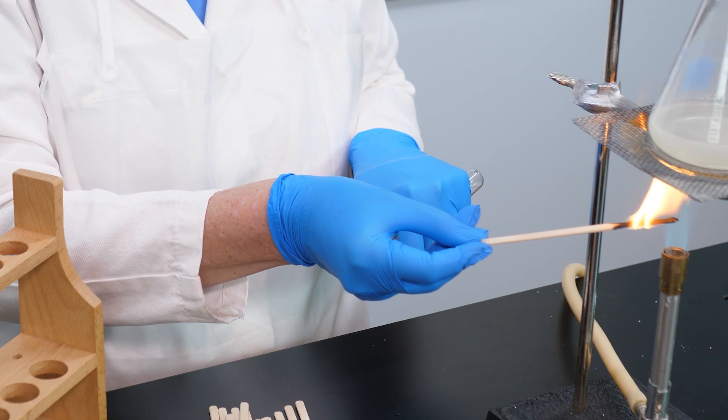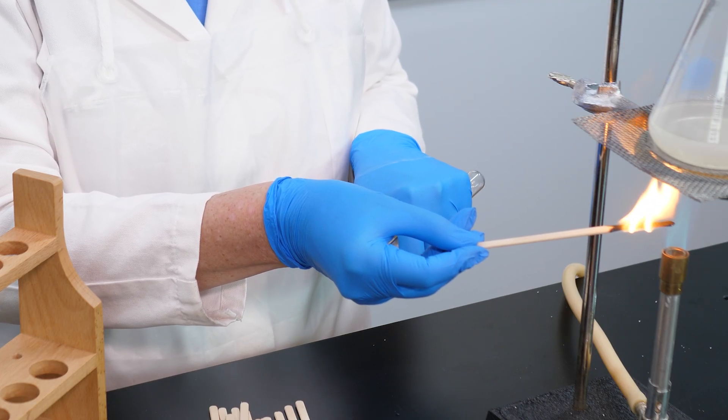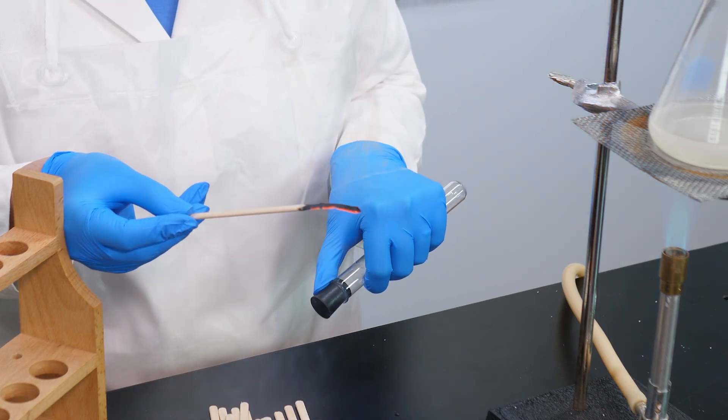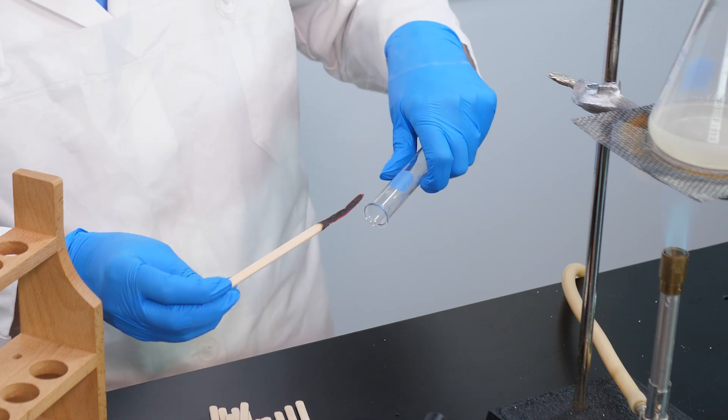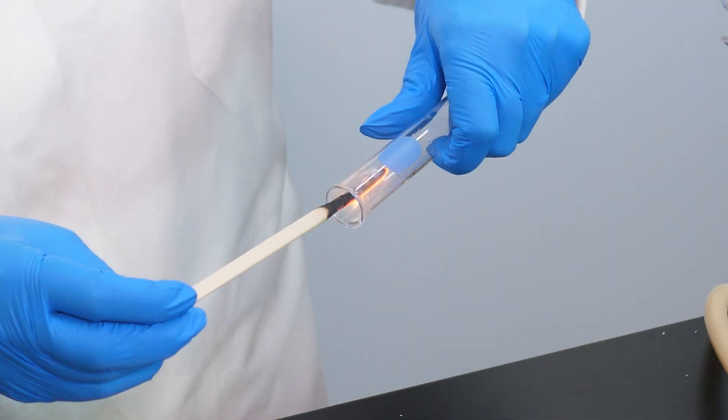We can test the oxidizing ability of oxygen with a wood splint. However, this time, we blow out the flame before we insert it into the tube. When we insert the glowing splint into the oxygen-rich atmosphere inside the tube, the flame is rekindled.